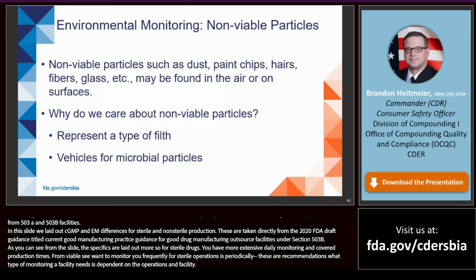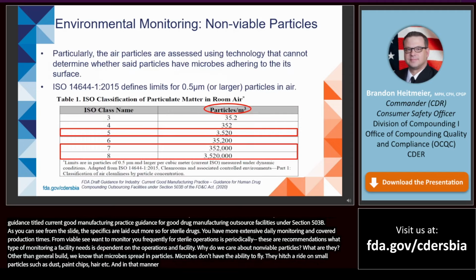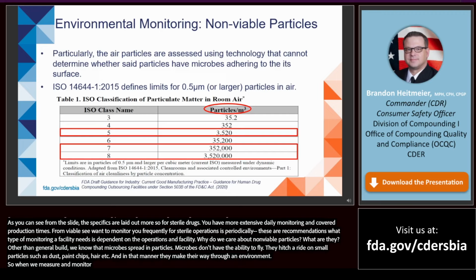Why do we care about non-viable particles, and what are they? Well, other than general filth, like a dusty shelf, we know that microbes spread and move via particles. Microbes don't have the ability to fly. So basically, they hitch a ride on these small particles, such as dust, paint chips, hairs, fibers, etc. And in that manner, they make their way through an environment. So when we measure and monitor non-viable particles, we are not looking at whether they have microbes attached or not. Rather, we are just using specialized equipment to detect and quantify the particles.